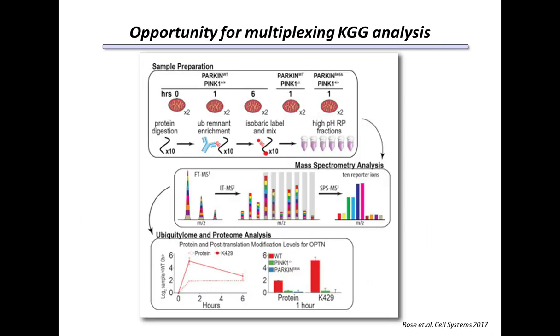Now, if we hope to get there, the place that we can see moving is toward multiplexing, and there has been some nice work that's been done by Steve Gygi's group, Chris Rose, and others to take advantage of some of the existing multiplexing technologies.